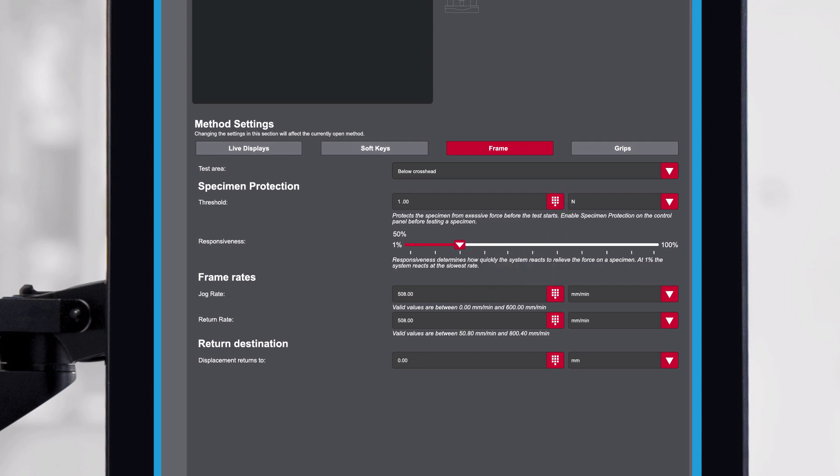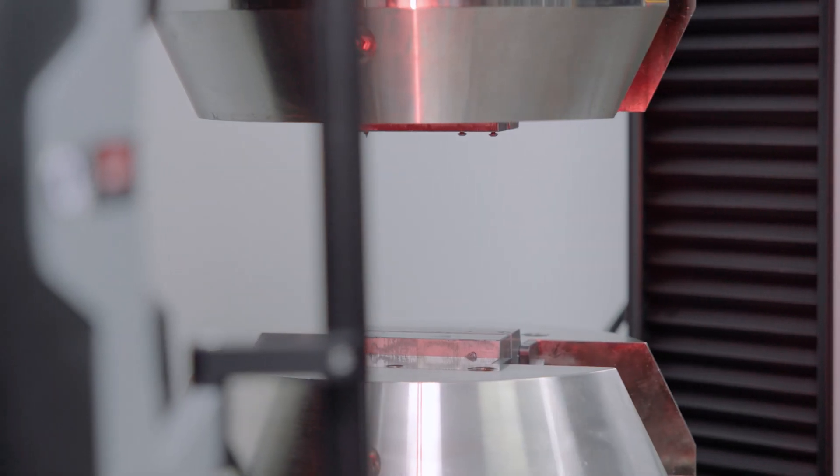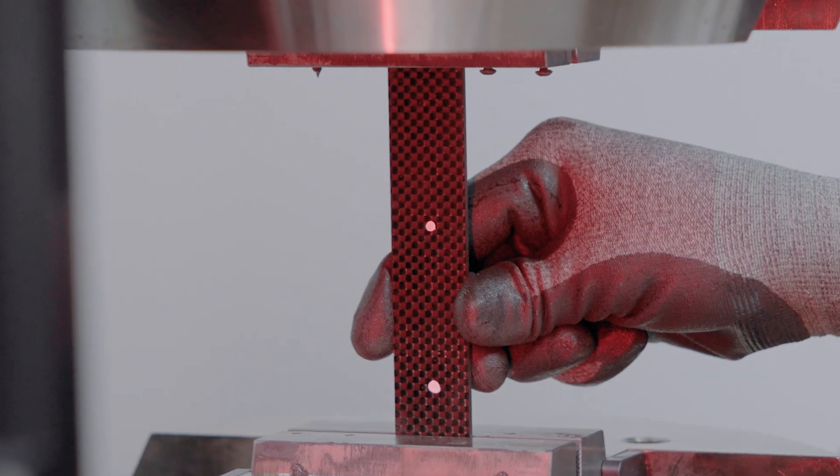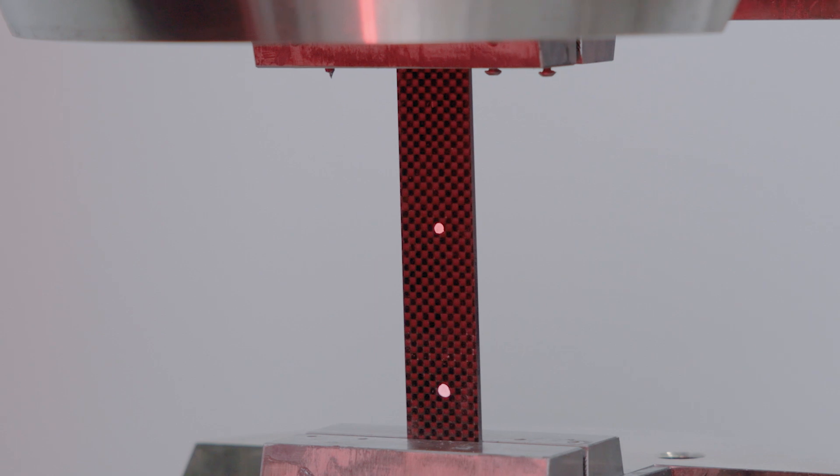The responsiveness defines the speed at which the frame will adjust to reach the load threshold. Typically, we'll want to use a low responsiveness for fragile or extremely stiff materials such as composites or glass, to prevent the specimen from fracturing prior to starting the test.